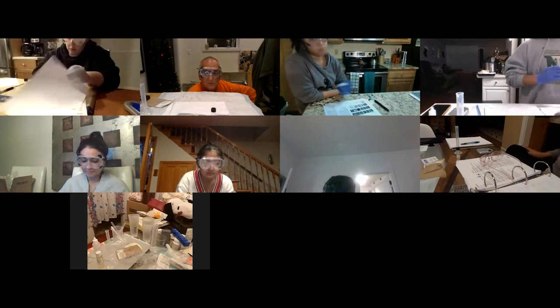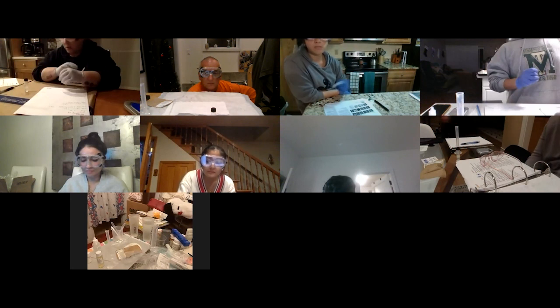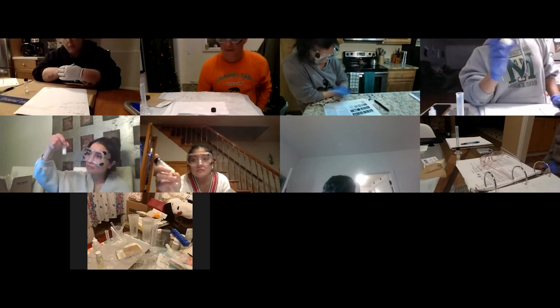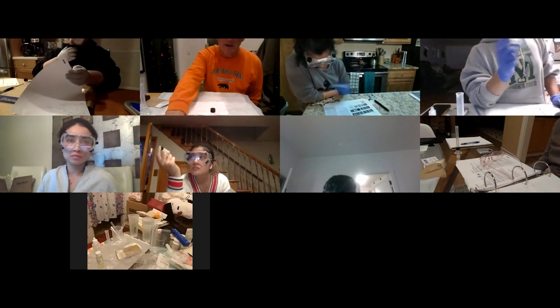Do you have to shake it until there's absolutely no layers? Because once I stop, the two layers begin to form. Right. Yeah, I have to check. I can't remember. How long does it give you as a time to shake it? I mean, the best thing to do would be to put it on a paint shaker for 3 days, but not everybody can do that.